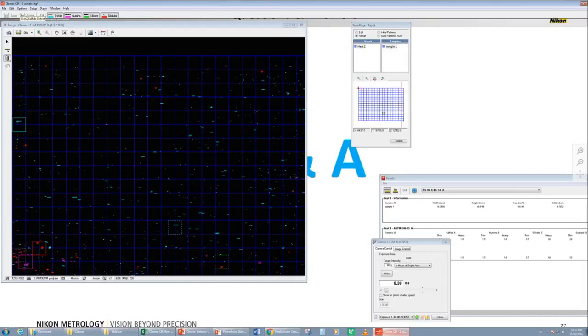Okay, thank you. There's one final question that arises. Do we need to validate each sample? For example, when we are analyzing 30 samples, do we need to validate each one?